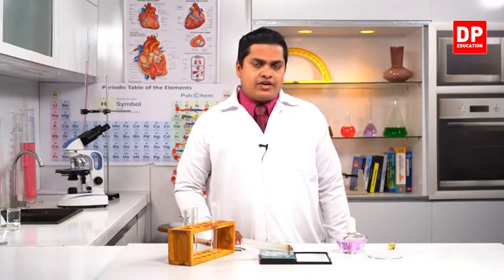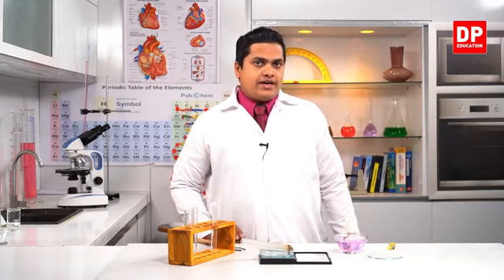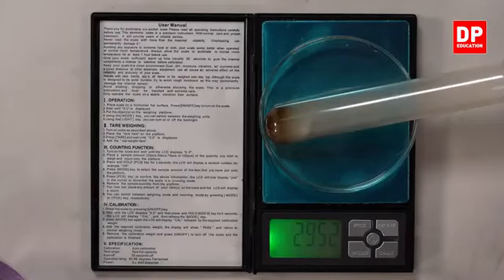In the early activity, some amount had increased, and in this activity, some amount has reduced. From 29.62 it has dropped to 29.52. Here you can observe 29.52. This is the final answer.